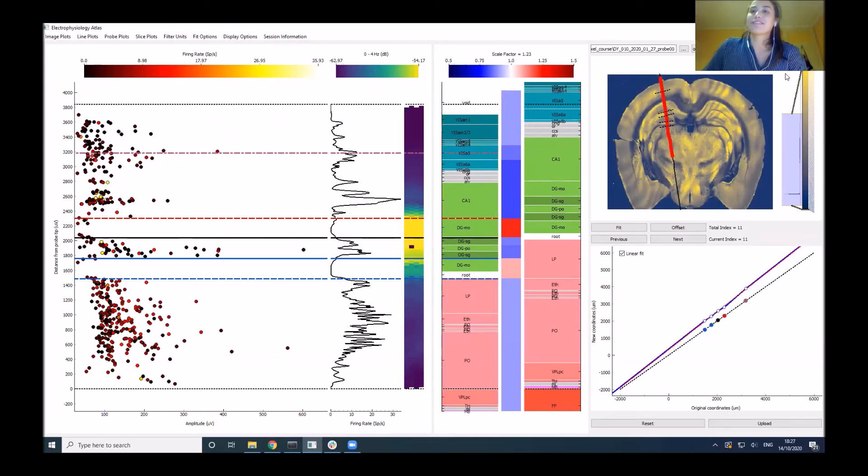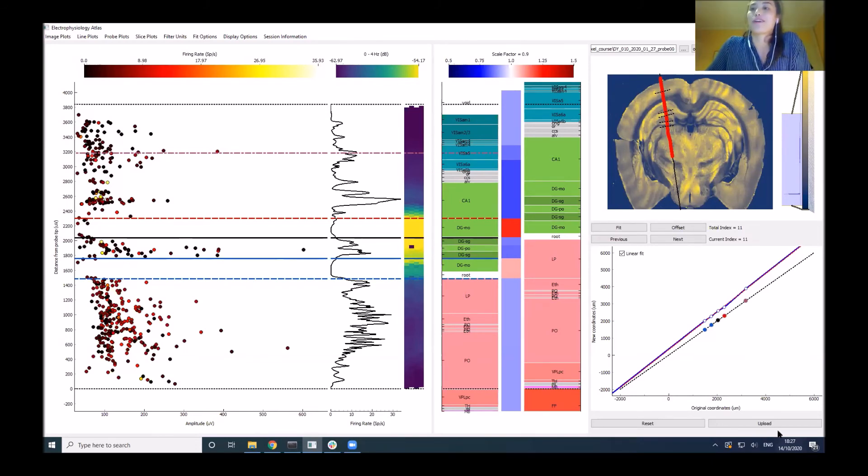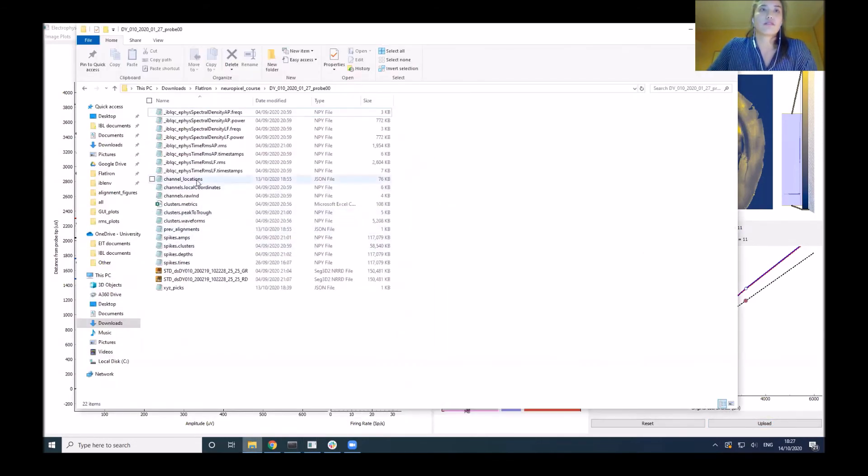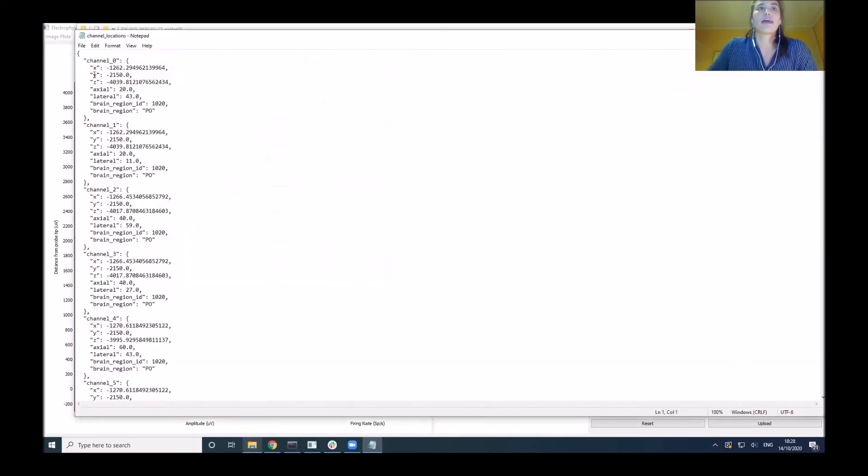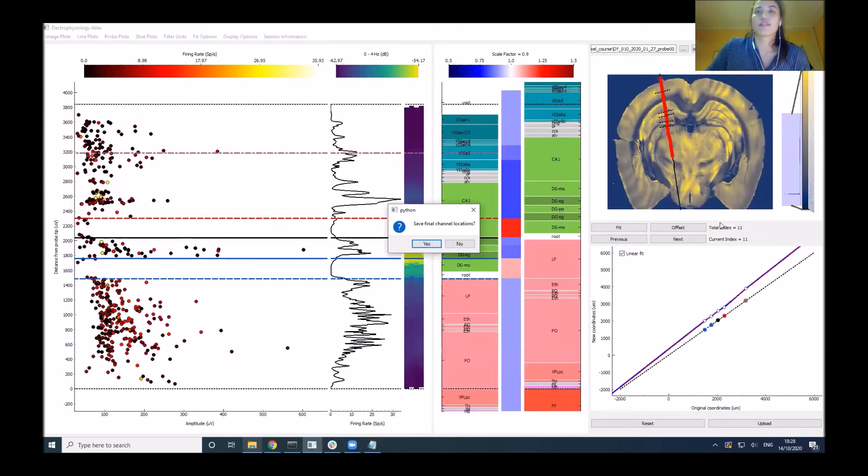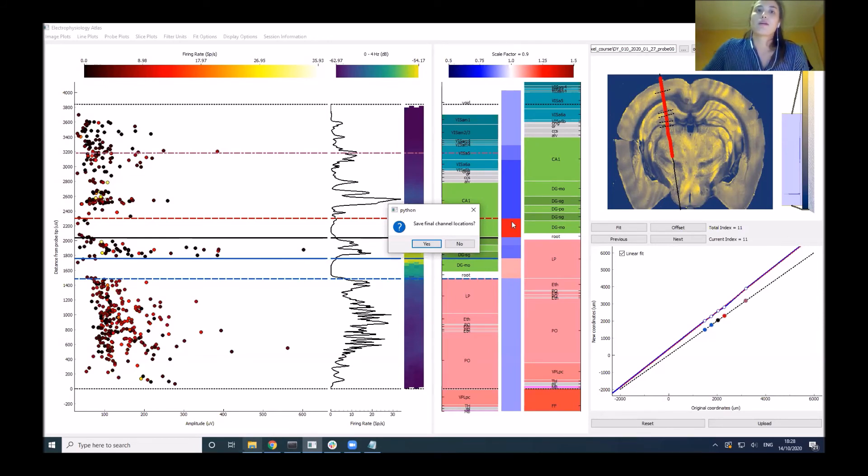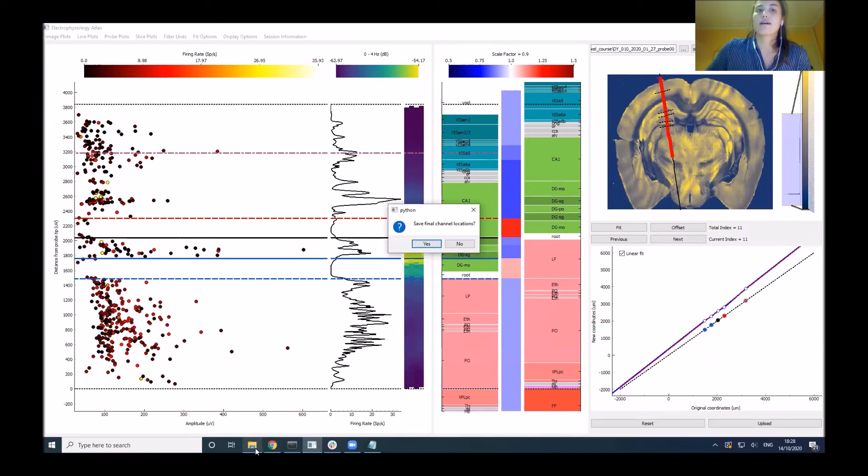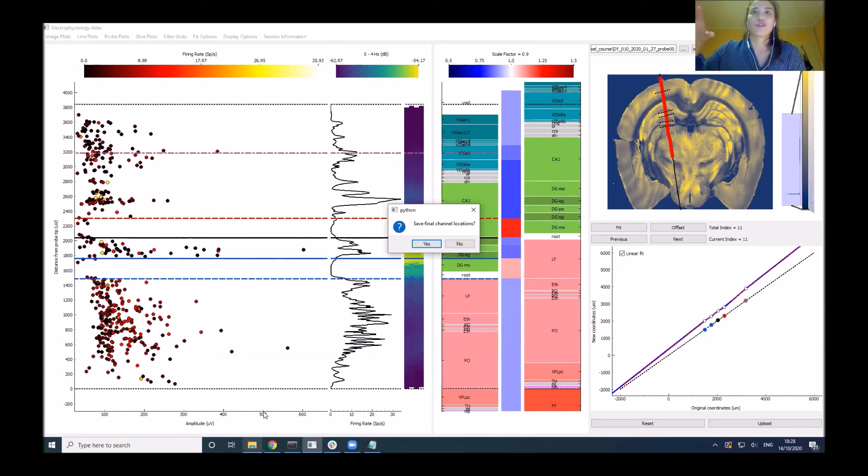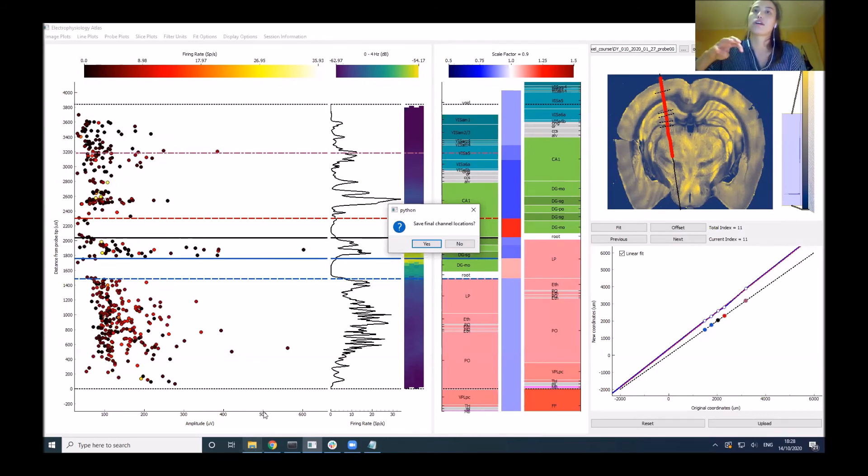Once you're done with the alignment, you can upload and it will record all your channels in a JSON file. You have your channel number, your location in 3D space, and the brain region and brain region ID assigned to it. At the moment, I'm using this from a local set of files. This is completely independent of the IBL data infrastructure, done offline on a local file system. There are a number of file inputs it requires. I've prepared a couple of data sets that users can look through, and there are instructions for how to run this in offline mode. I've also developed a script that can take the output from Kilosort and prepare all the data files in the correct format that can be read into this alignment GUI.